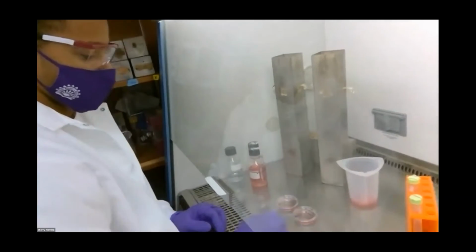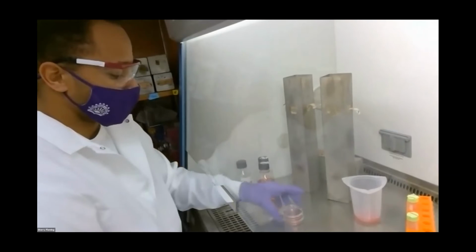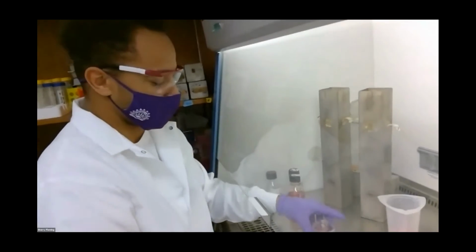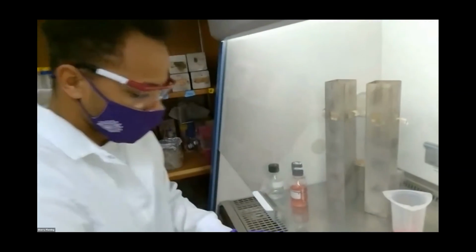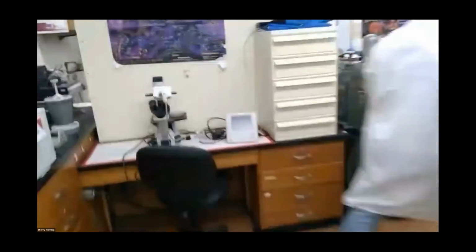Go ahead, Devante. And now that I got them all seated on, I will go ahead and put them in the incubator, and then I will do this again on Monday. So he does this usually Monday, Wednesday, and Friday. We've made it special for today, but every week these cells need to be fed and taken care of.